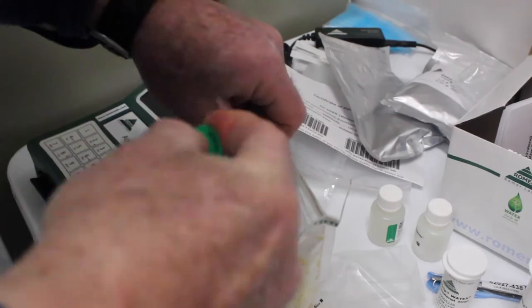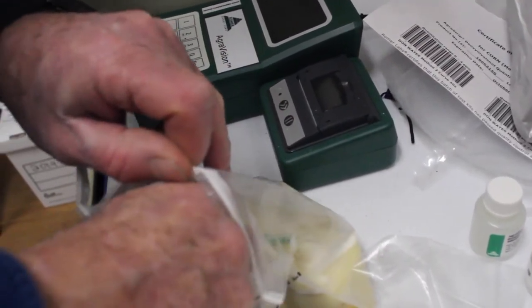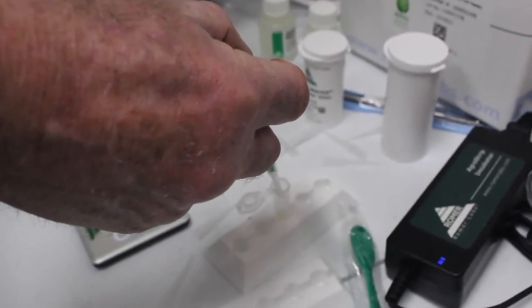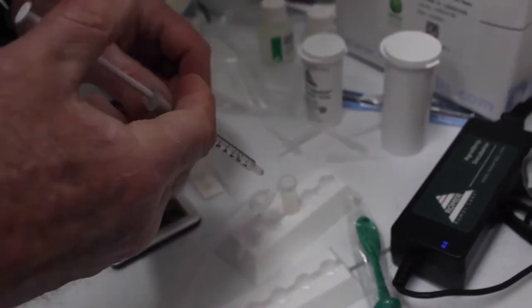You then take a very small sample of the fluid for testing — 50 microliters, which is five one-hundredths of a milliliter. You place it in the mixing container, then you add a dilution solution to the container, snap it up, and shake it again. Basically what we're doing is diluting it with this dilution solution.